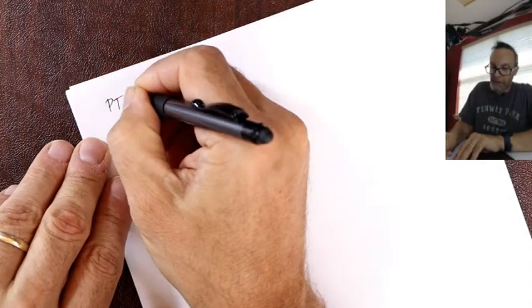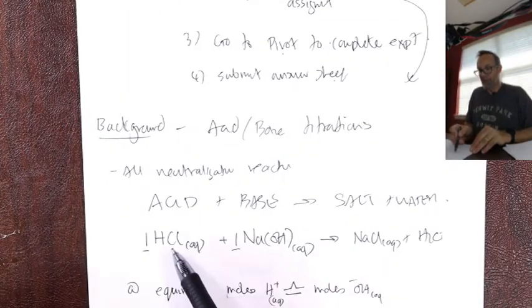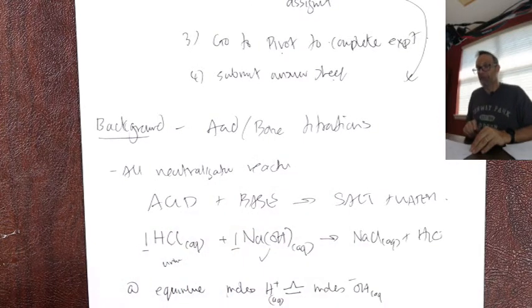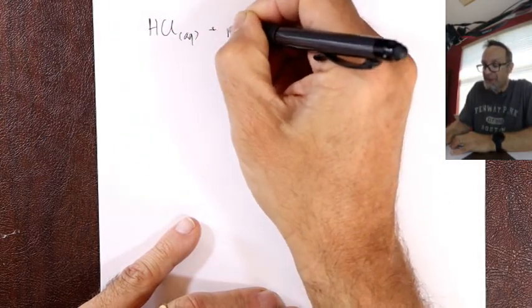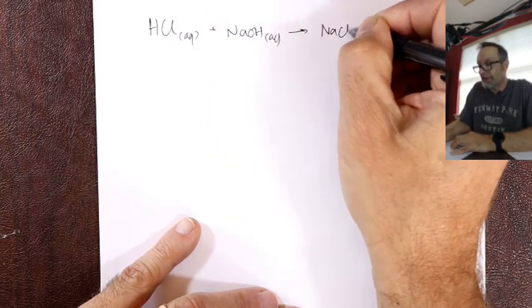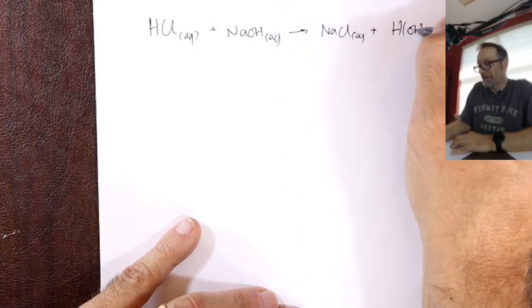In part 2, it's that same titration we looked at on the first page, okay? So we're going to have this now as our unknown, and this we've just found its concentration, right? So it's the same titration, the classic titration, but we're going to do it now for points, right? So HCl plus NaOH turns into NaCl plus H2O. I write it as I like to write it, like that.